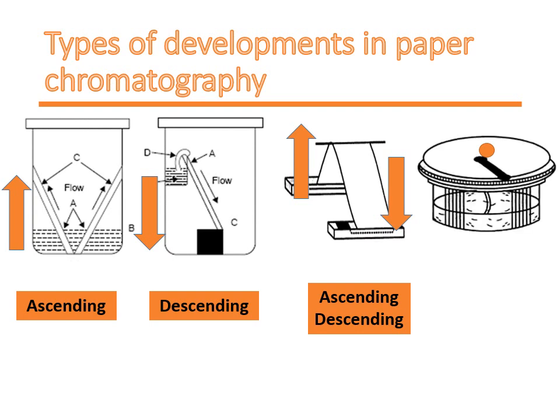As the name indicates, the separation here takes place on paper which is used in the circular form. This is called circular chromatography. In this case, the sample is applied at the center. The filter paper used has a wick in it, which is dipped in the mobile phase taken in a suitable shaped chamber.